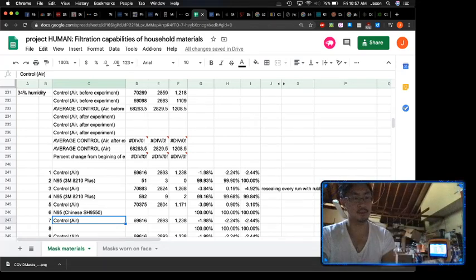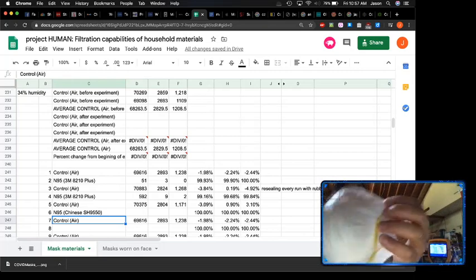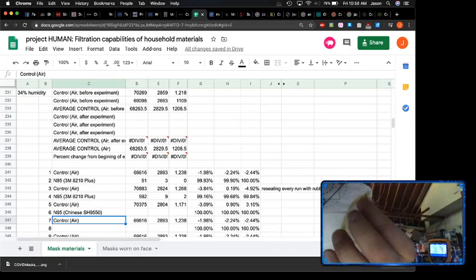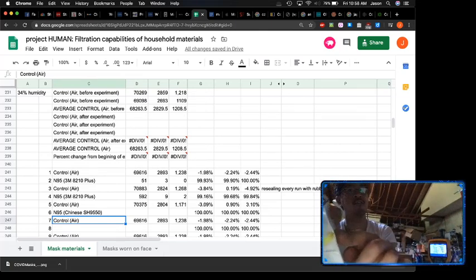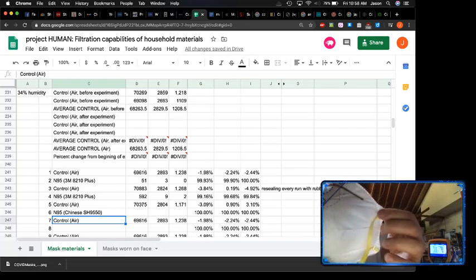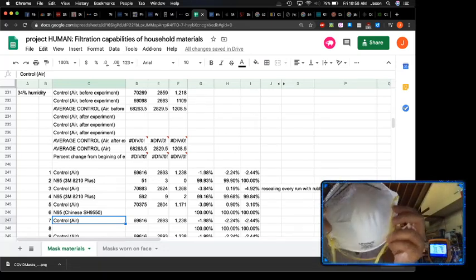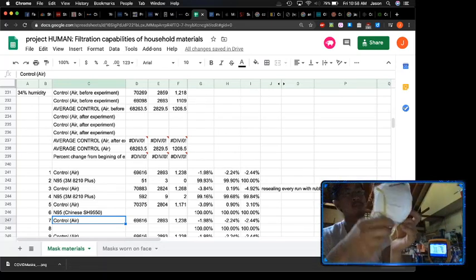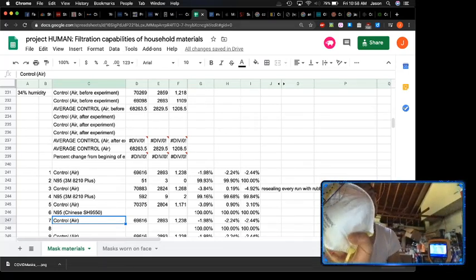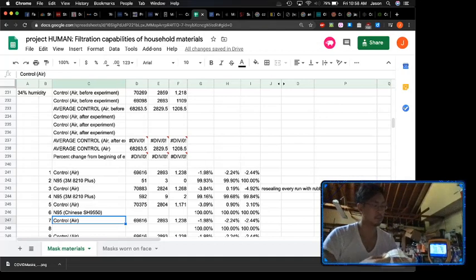The good thing is the staple itself is not on the part of the face mask that is at the interface of the skin and the mask. It's on this kind of tab part, so I don't think it'll affect the efficiency, but I can see why we might have a poor fit with these Chinese N95s. But the first thing we're gonna test is the actual material.